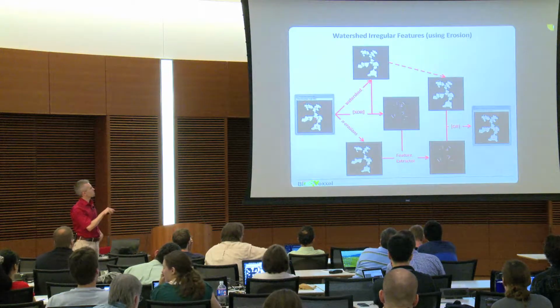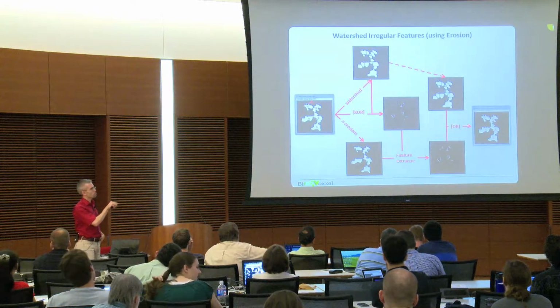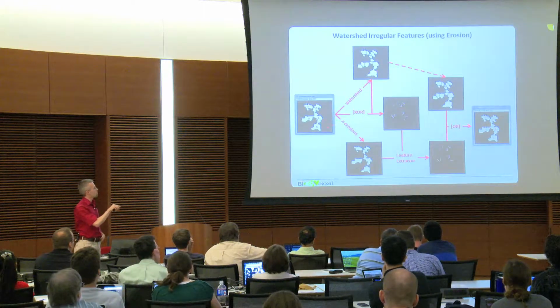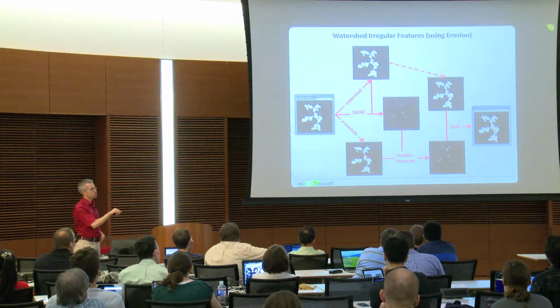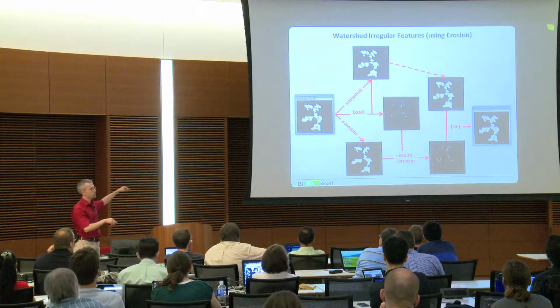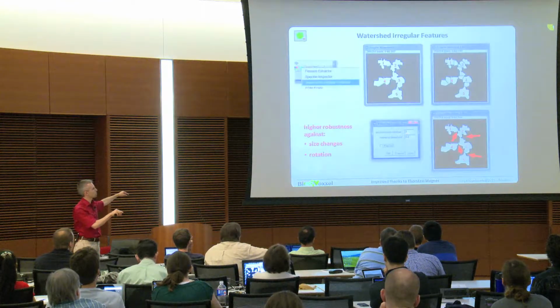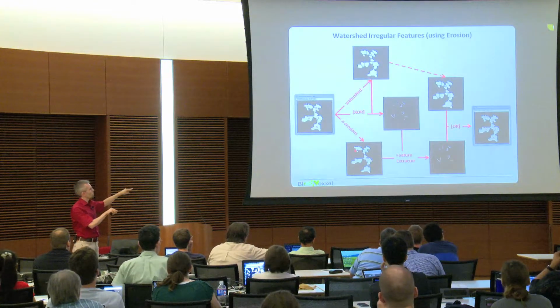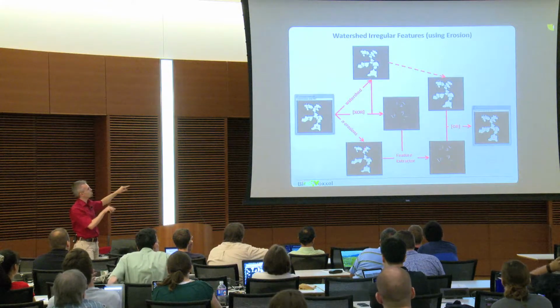It takes the original image, and in the background it does 2 things. It takes one image where it does the normal watershed, and one image where it does an erosion as often as you key in the erosion cycle here. The erosion makes the particles smaller, and then it compares these 2.